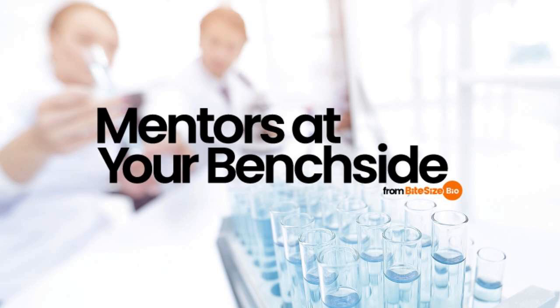Tailoring your extraction protocol to your specific tissue type will help you overcome these. Keep a detailed record of all the different approaches you try to learn what works best for your sample. However, the following practical actions will improve any extraction protocol. Prepare all your buffers, dilutions, and equipment beforehand. Pre-equilibrate them to the temperature outlined in your extraction protocol.